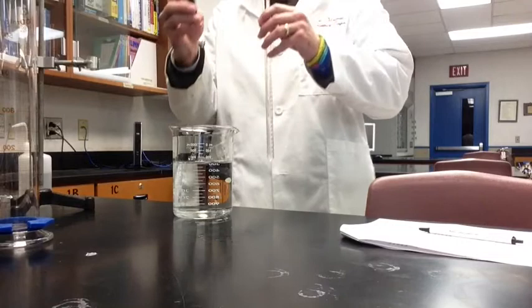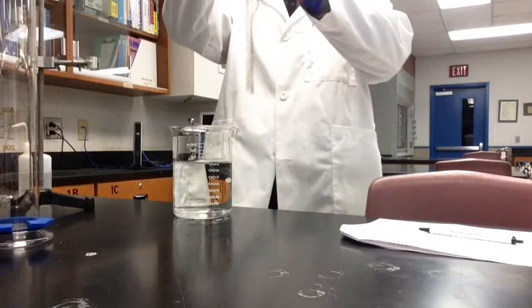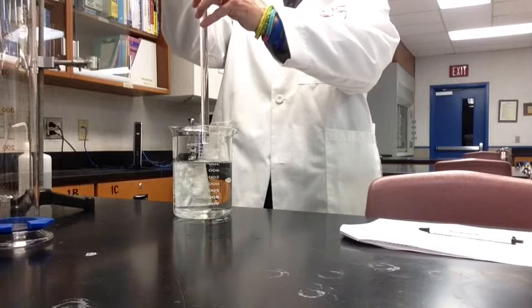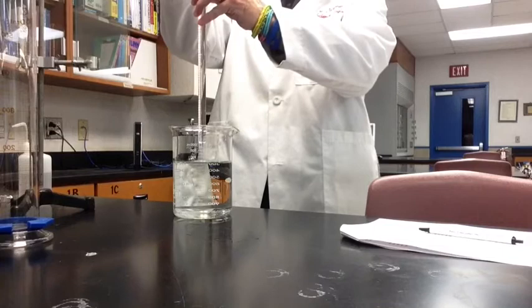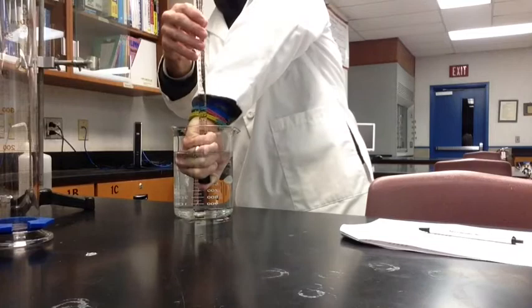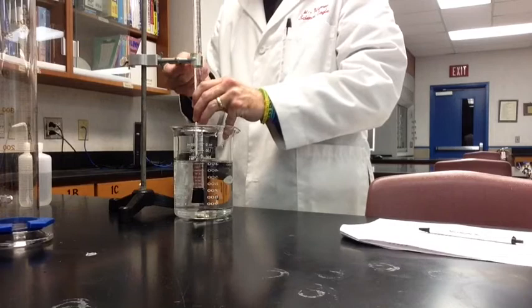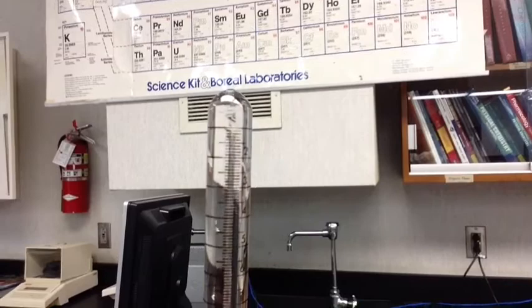Air bubbles will cause error. You need to know how that air might propagate through the experiment — if you have volume taken up by air before gas is collected, how will that affect your final measurement? Put the cork in over the beaker so any spilled water runs into it. Then put your finger over the end of the rubber stopper and flip it upside down into the beaker. One of you can hold the eudiometer the entire time, or you can use a utility clamp and ring stand. It will only take about 5 to 10 minutes for all the gas to collect.